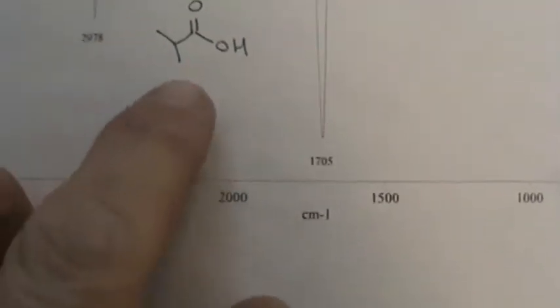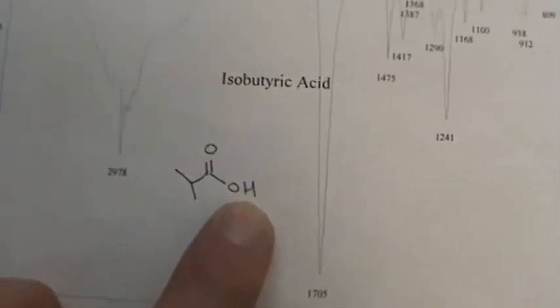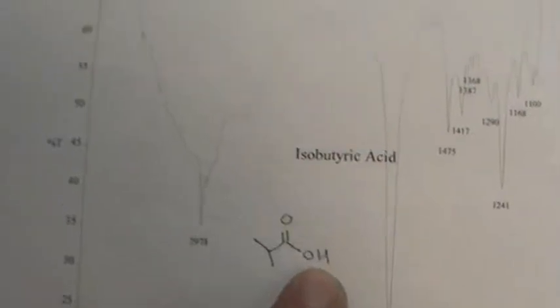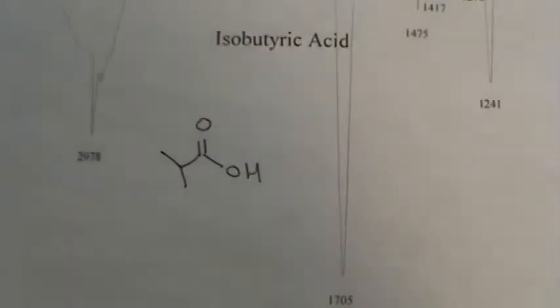So clearly, carboxylic acid, there's got to be some kind of OH stretch, and you'll tell by the reference spectra that is in Pavia. You're going to have a large structure, which is the whole thing here. This whole vast blob is part of the OH stretch of a carboxylic acid. Students in the past used to actually do a baseline correction on this line. This is not baseline. It's part of the overall OH stretch of a carboxylic acid.